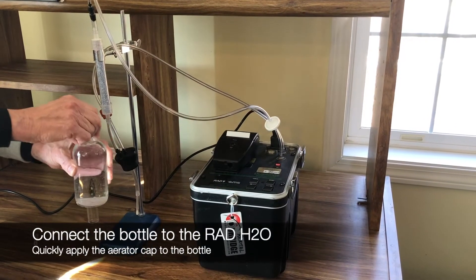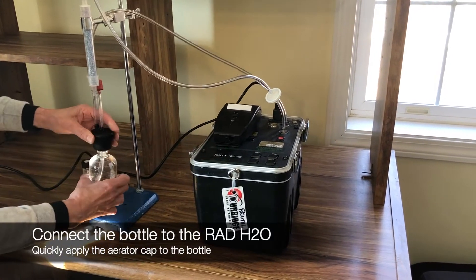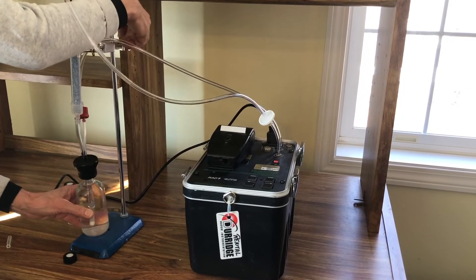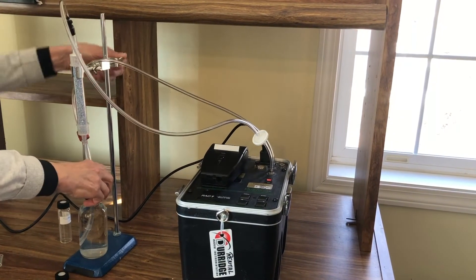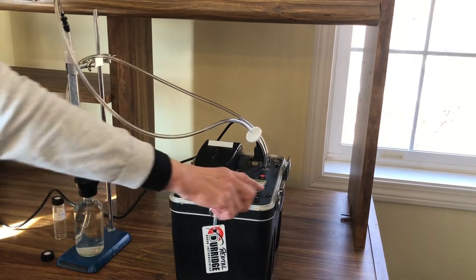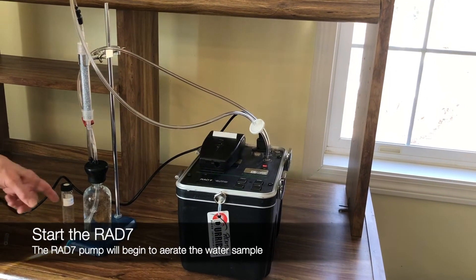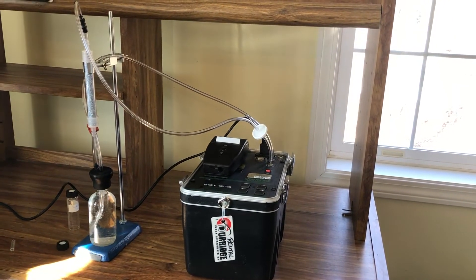We'll take the cap off of our water sample and screw it on. We're going to lower the clamp down so that it rests down. The cap is on securely. Now we're going to hit start. Now the air from the rad7 is going into the water sample and aerating it. This will continue for five minutes.